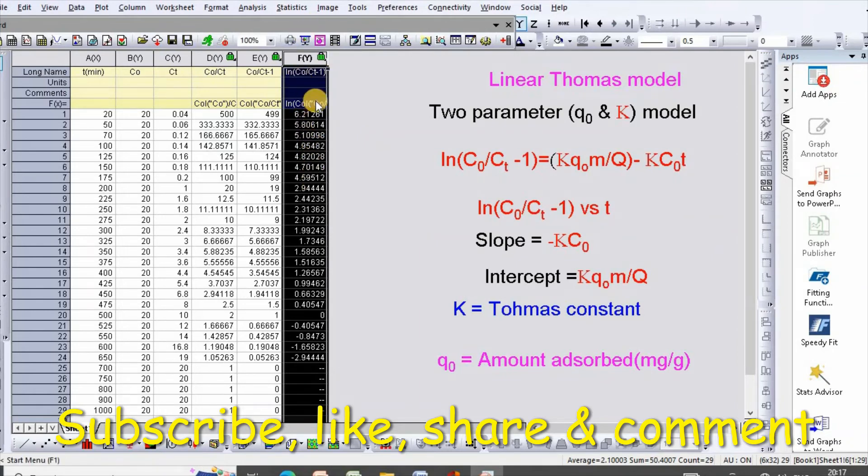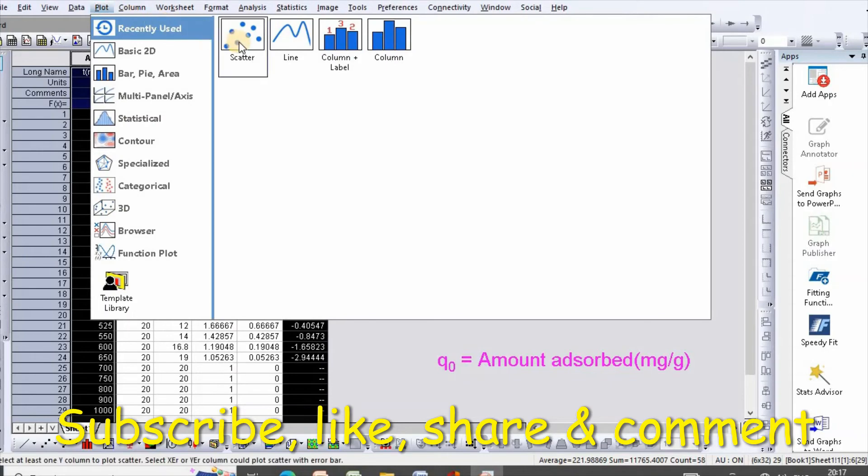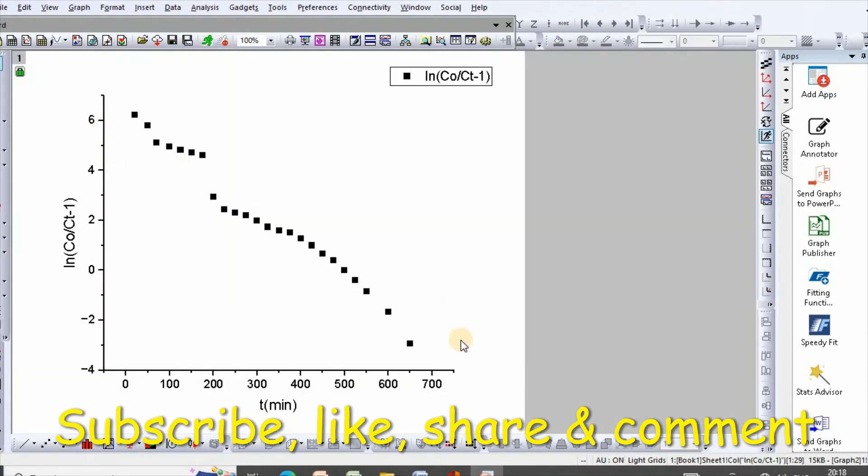You need to select this and type, then go to plot, then select this. Here is our plot.